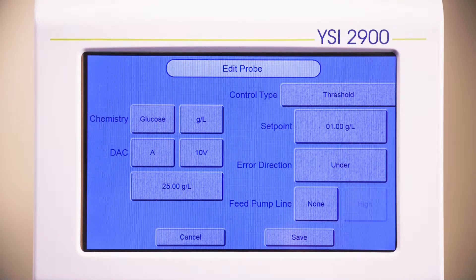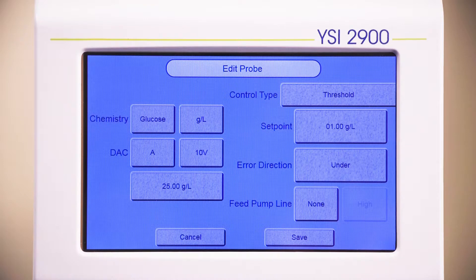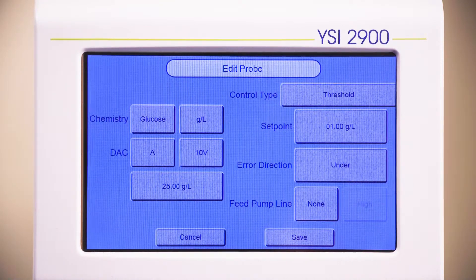If you select below the concentration, the alarm will activate when the instrument output drops below the set point. If you select above, the alarm will activate when the instrument's output is above the set point.